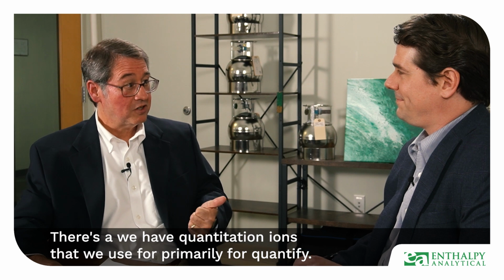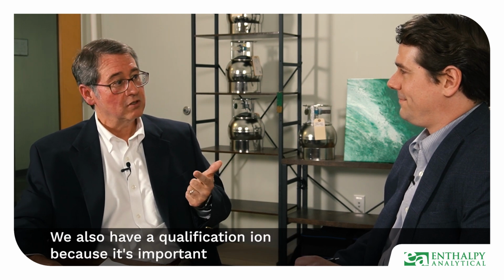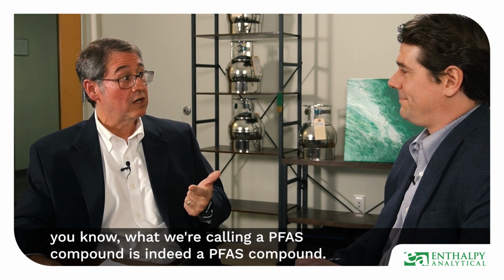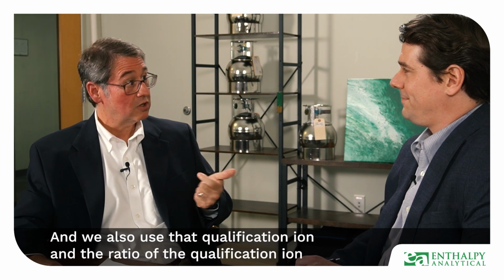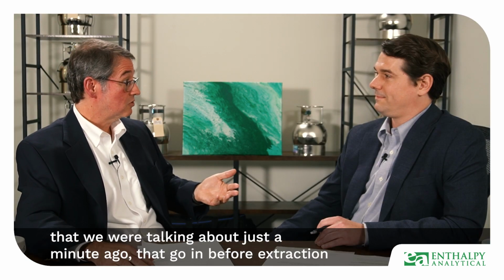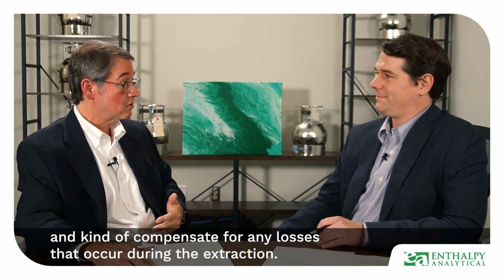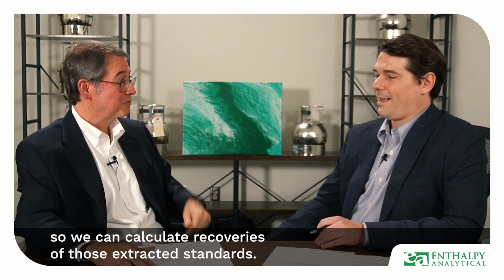We have quantitation ions that we use primarily for quantifying. We also have a qualification ion, because it's important to ensure that what we're calling a PFAS compound is indeed a PFAS compound. Right. So we use retention time, and we also use that qualification ion and the ratio of the qualification ion to the quantitation ion. And then on top of all that, we have the extracted standards that we were talking about a minute ago that go in before extraction and compensate for any losses that occur during the extraction. And then we have the unextracted standards so we can calculate recoveries of those extracted standards.